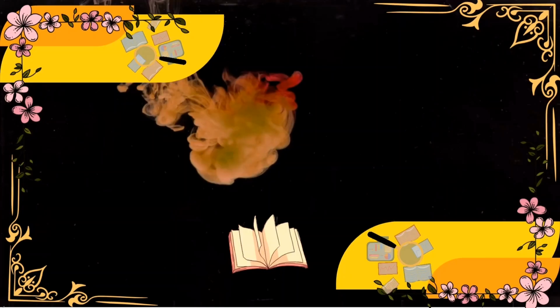The IRGA measures the concentration of CO2 in the air before and after it passes through a chamber containing the plant or the plant leaves. The reduction in carbon dioxide level due to photosynthesis or increase in the carbon dioxide level from the respiration process is quantified by the IRGA based on how much infrared light is absorbed by the carbon dioxide molecules in the chamber.